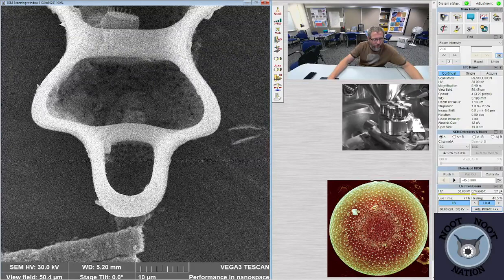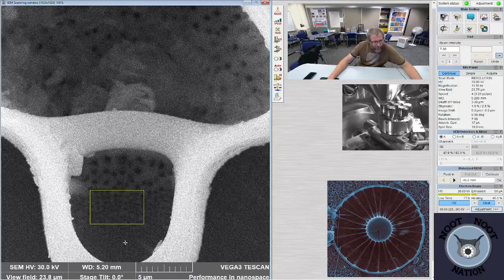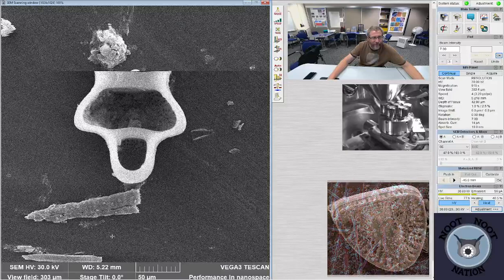I think that one actually has the ends preserved, and you can see those got little tiny holes down there. The apical porefields, or the ocelli, are preserved on this one, so not all of them have their ends busted out. This one's got a bunch of junk in it, though, which isn't helpful. We're trying to look at pretty structures on the insides.